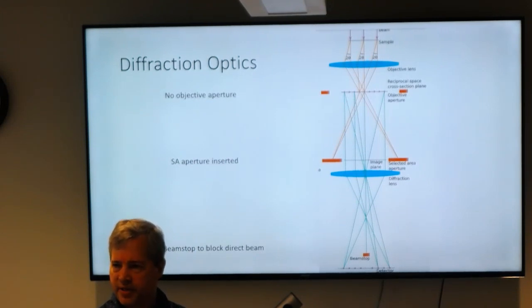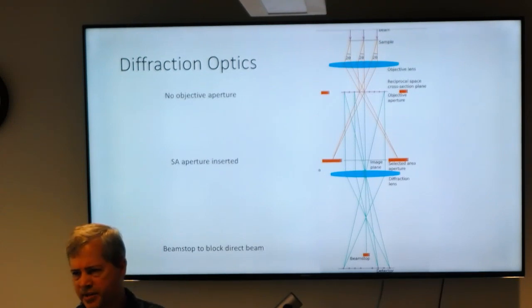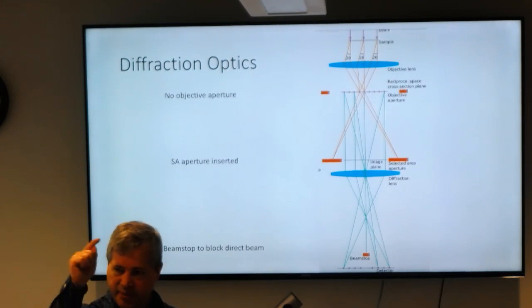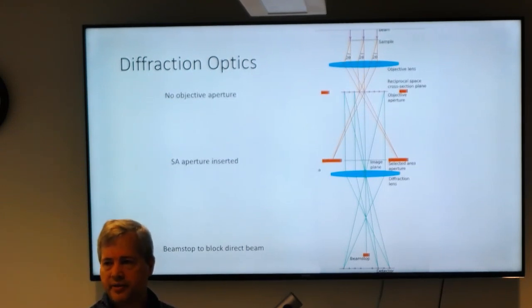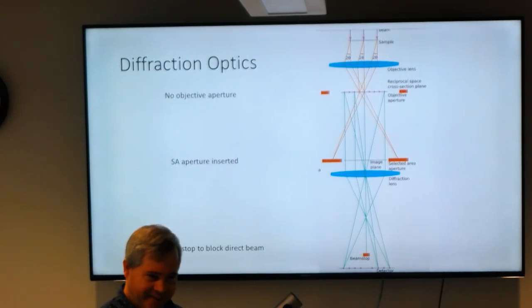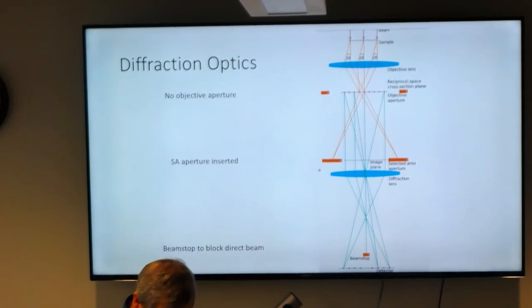We have collected without using a beam stop a little bit. I did it with Matthias, but generally it's probably better to use one. I wouldn't feel good about continually hitting it with this bright spot. On the direct detector, like the K2, it would wreck it. It's a CMOS, but it's a bare detector. There's no scintillator. We've also done it on the DE camera, and that one also was sensitive. It did recover, but don't collect the diffraction on the direct detector.